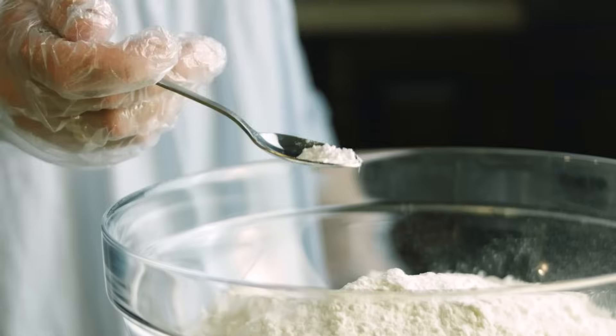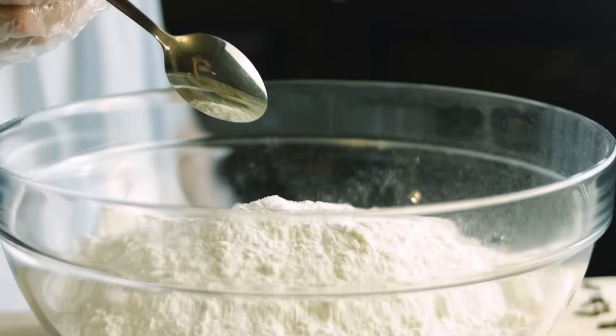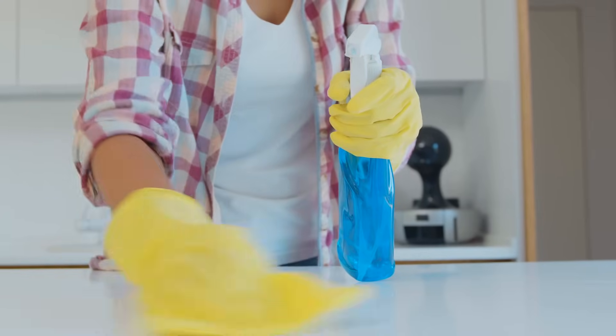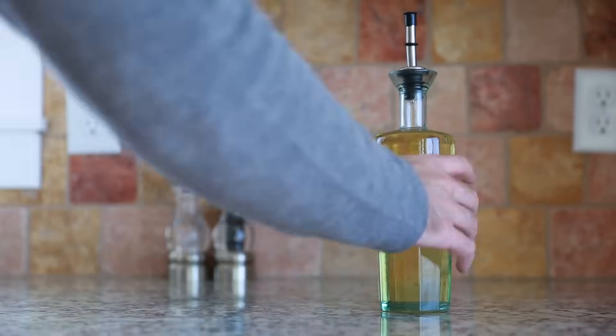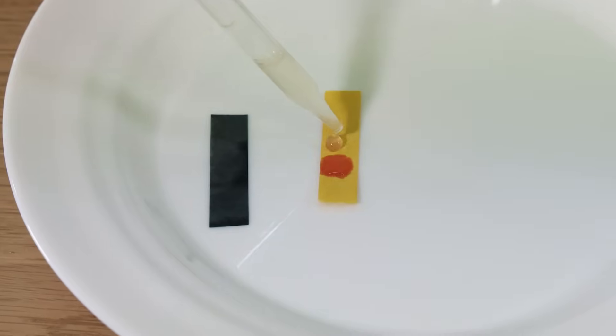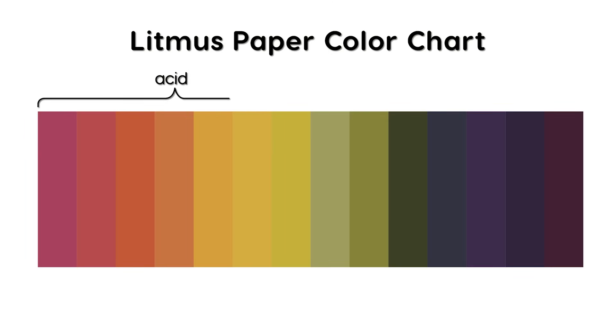In this experiment we will test the pH levels of four everyday substances using litmus paper. Litmus paper is a special type of paper that changes color when exposed to acidic or basic solutions. Let's see whether our selected substances are acids or bases.